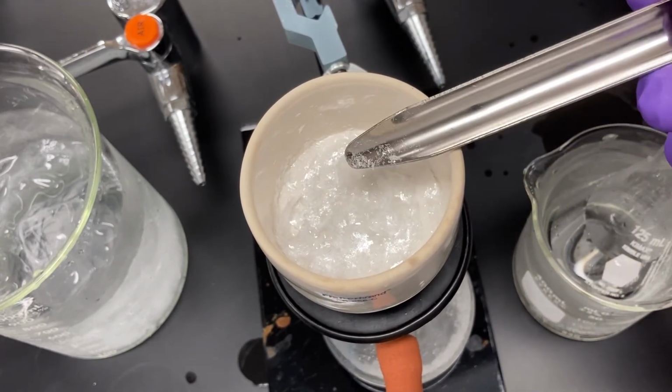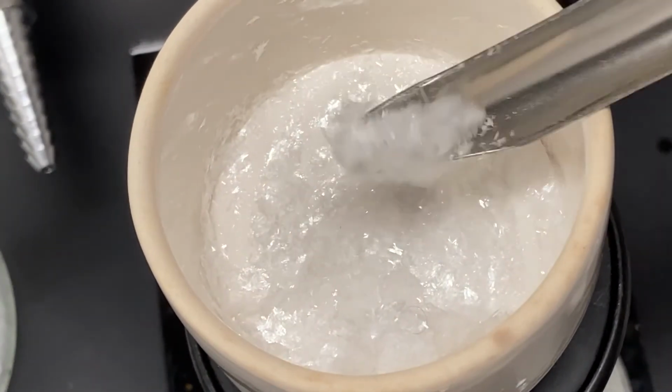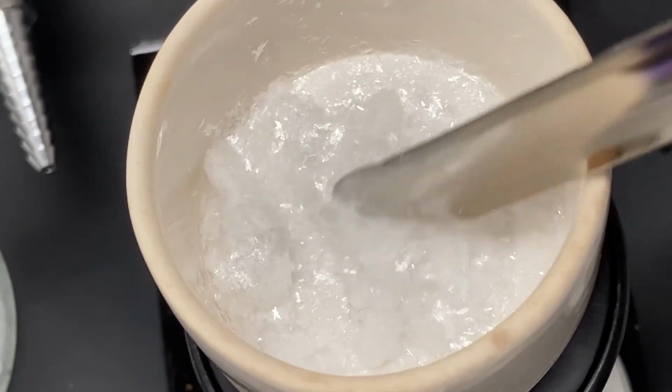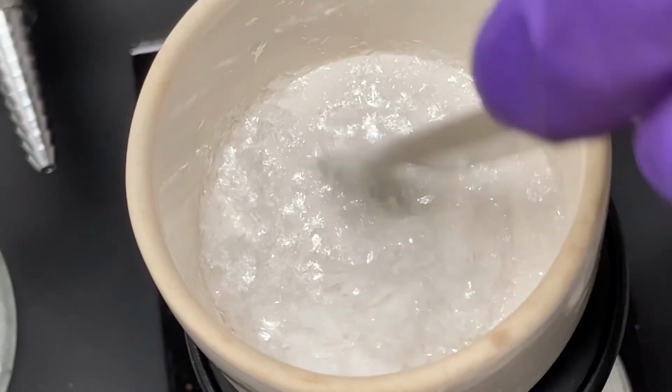Let the crystals sit in the funnel for a few minutes. This will dry the crystals. Use the metal spatula to move the crystals around. If the crystals stick to the spatula, then the crystals are still wet. Dry crystals will not stick to the spatula.